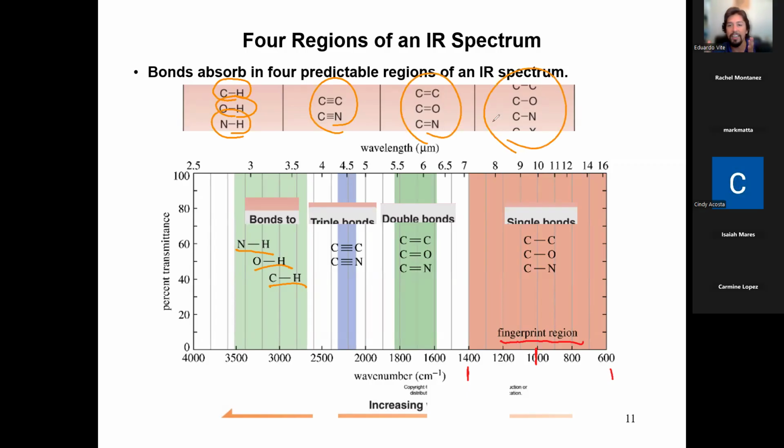So yeah, it'll take a bit of looking at it and referencing it, but the sooner you get an intuitive understanding or memorize it or keep it in your brain somewhere, the much better and much easier it'll be. This is actually a quick process. We don't spend a lot of time as organic chemists looking at an IR. We take an IR in about 4 minutes, we print it out, we look at it for about maybe 5 more minutes, and then we move on to the next part of the experiment. It's crucial. It helps us know if we're heading down the right path when we're making a molecule, but the analysis itself, once you know it, is pretty easy and straightforward.